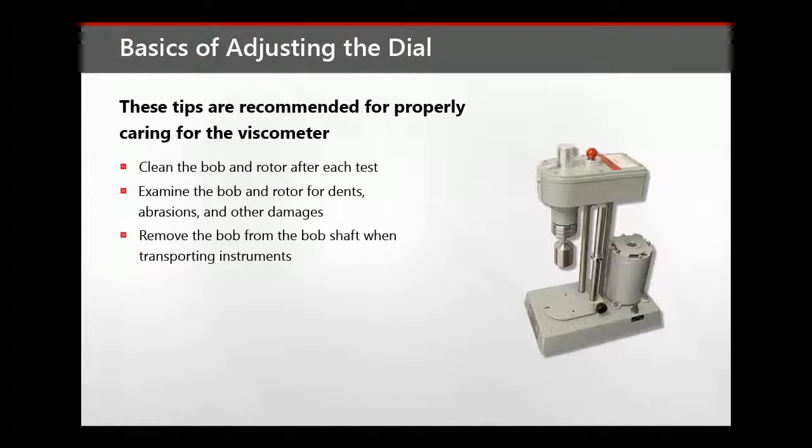Always remove the bob from the bob shaft when transporting the instrument to avoid bending the bob shaft.